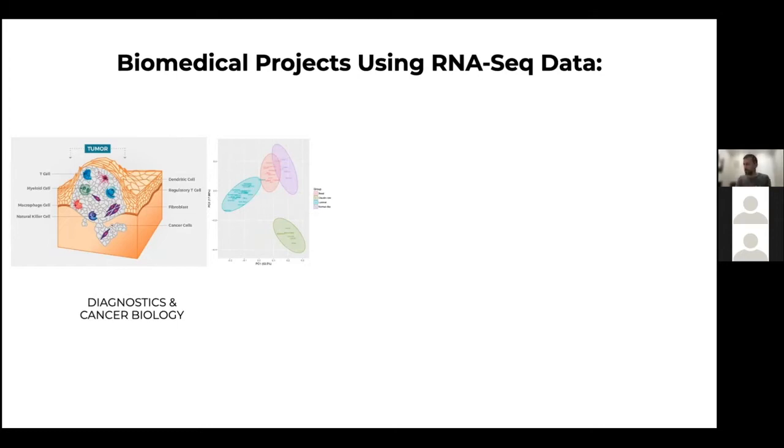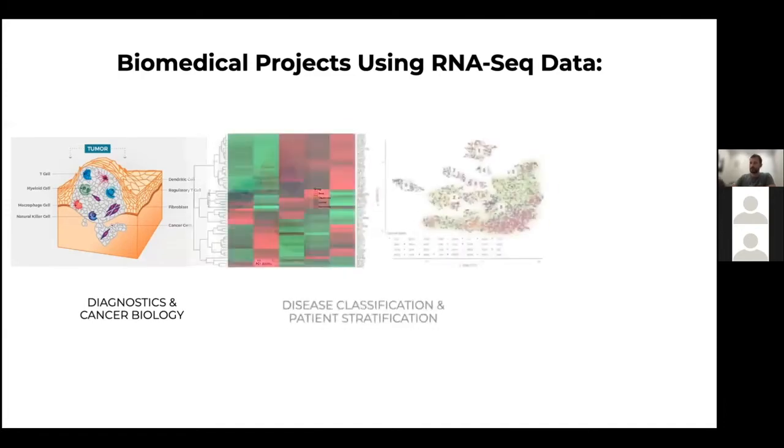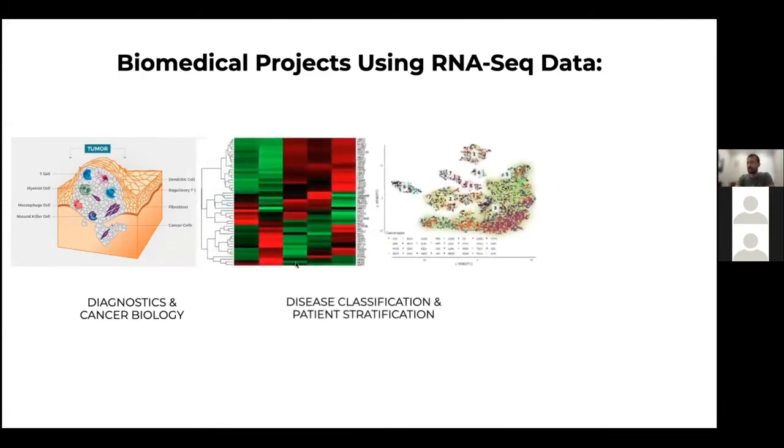Okay, let me pause here real quick and answer these questions so that we can move on. What do I mean by mRNA abundance? Imagine a gene. That gene is being expressed, and this actually relates to this image right here. So here I have what's called a heat map, and in this heat map, I am trying to represent different genes. So here I have a list of genes, and here I have different categories or classes of samples.